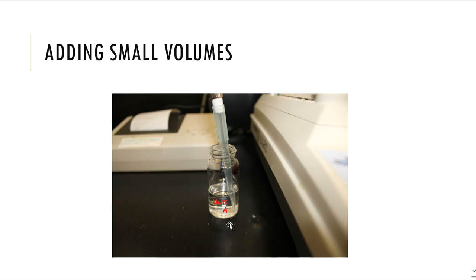And it was pretty uniform, miscible. There was nothing in it that was floating around, no particulates or anything. It did have an odor. It was a chemical odor. It smelled kind of fruity, but that's about as far as I want to say about it.